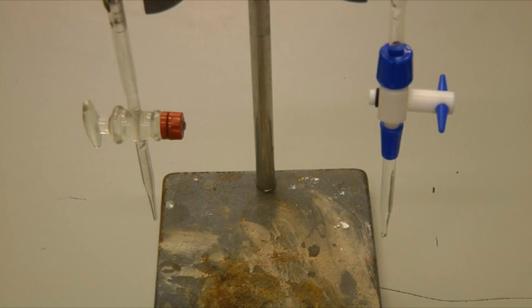For acid-base titrations, the acid is usually put into the burette as the alkali can react with grease on glass taps in older burettes. However, this is less of an issue with more modern burettes which have PTFE or Teflon taps.